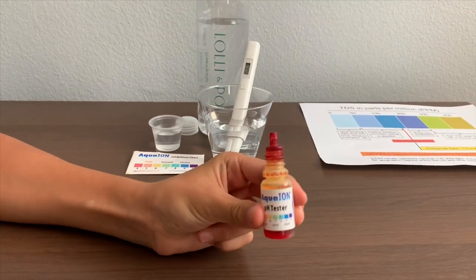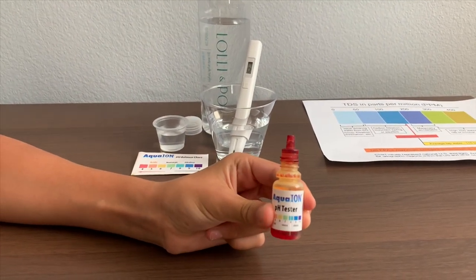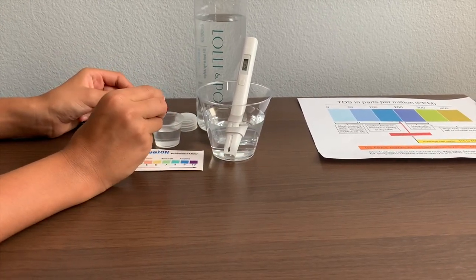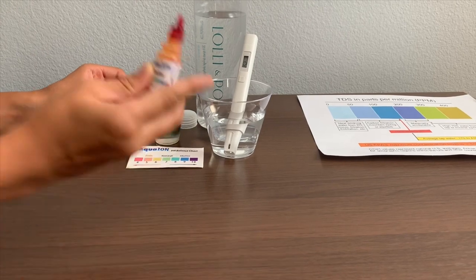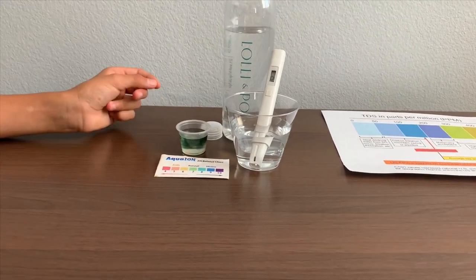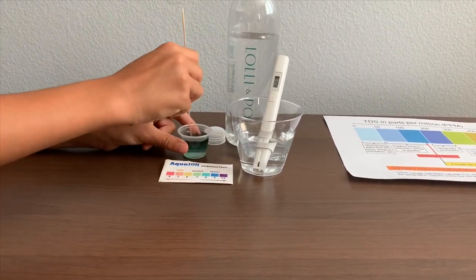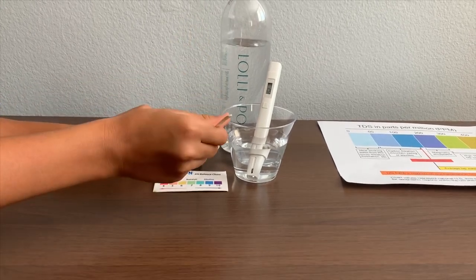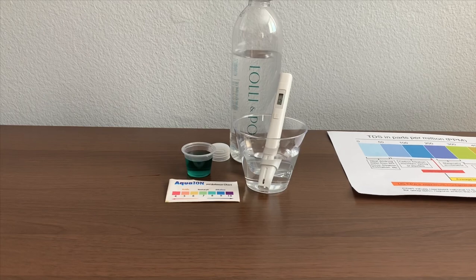Next, we're going to test the pH level. If you want to buy this pH tester, check the link down below. Make sure you do two drops only. Let's stir it in for a better result. I'll say that's an 8.